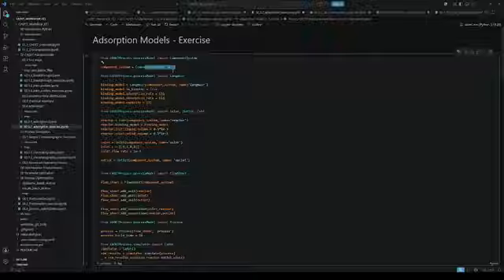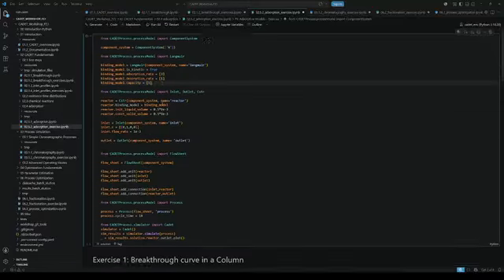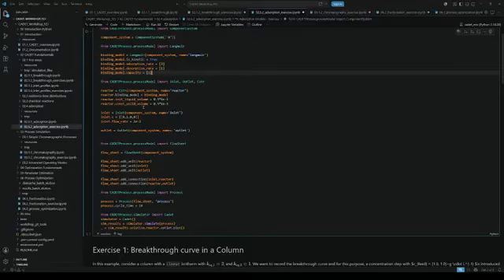So we define a component system, one component, let's call it A. And for this component, we choose now a binding model. And the binding model is Langmuir. We heard of Langmuir before. And for Langmuir, we have to determine an adsorption rate and a desorption rate, because we chose this to be true, that the system is kinetic. And we also define a Qmax, a capacity of our system.